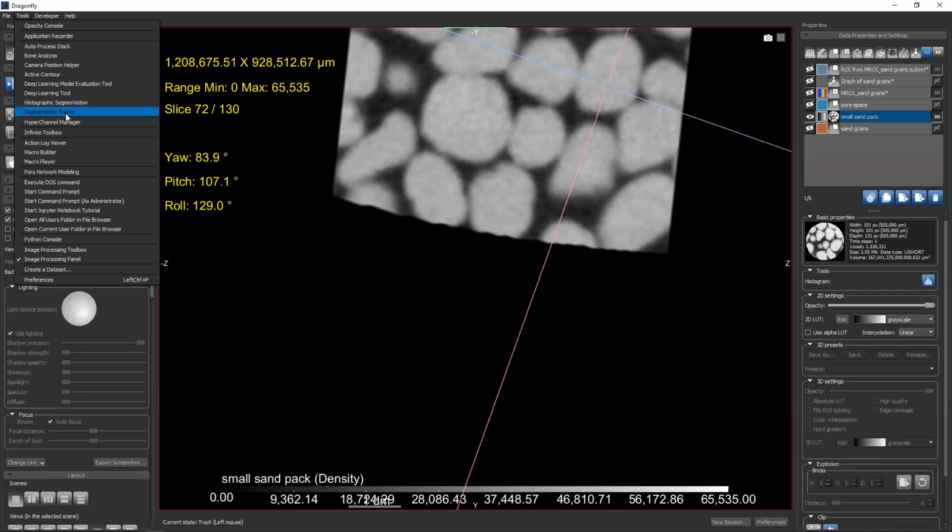They'll still be available. You can still do segmentation trainer methods without doing deep learning on the GPU, but we'll probably cover them in the future release because it's one wizard that drives all of it.